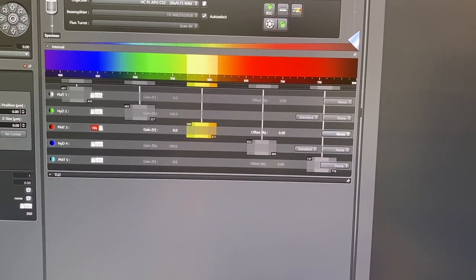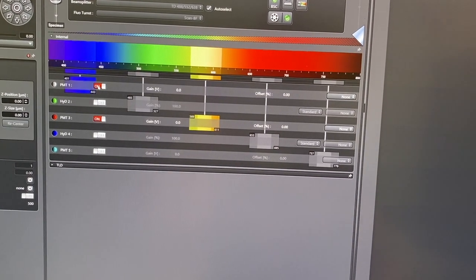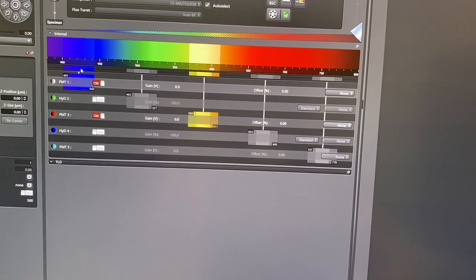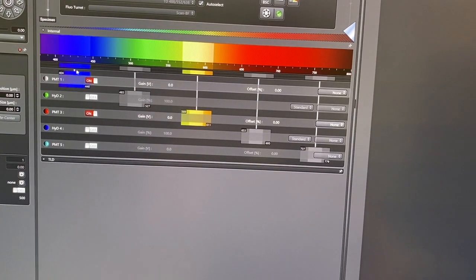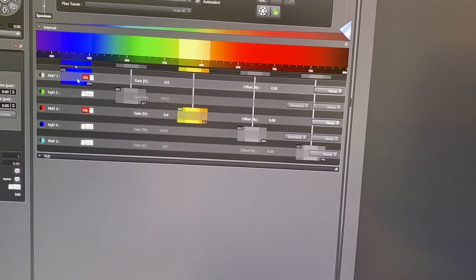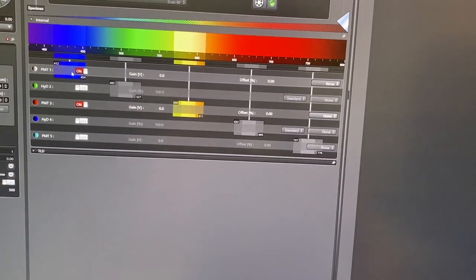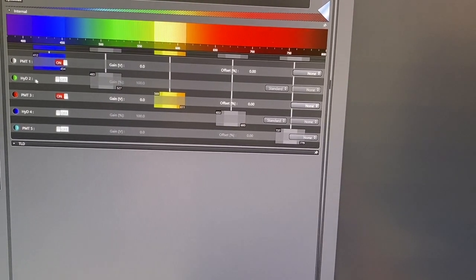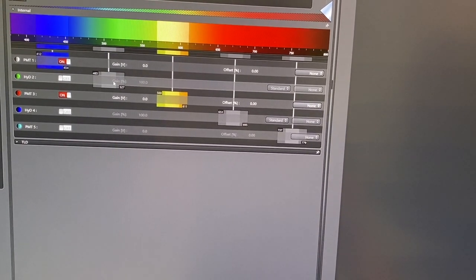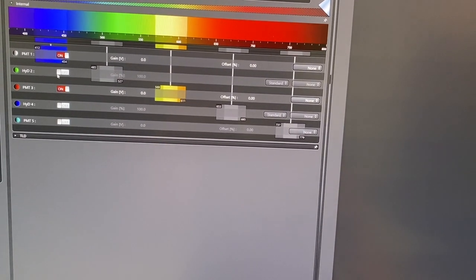For each detector that you'll be using, you'll want to select to turn on the detector, and then the corresponding detector window will become colored, indicating the detector window that matches the detector you just turned on. If you go down the row of the detector, you should easily be able to see which detector window corresponds to that detector.